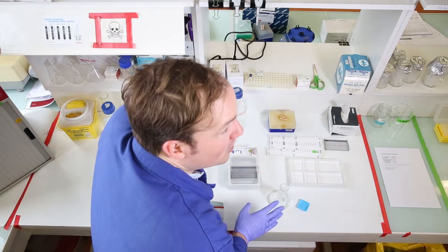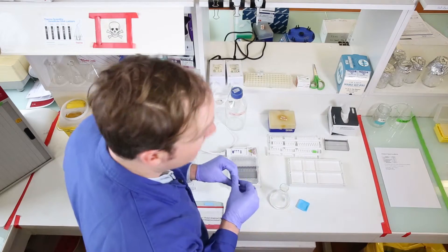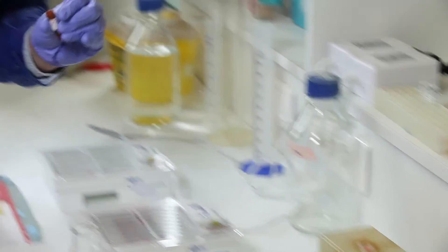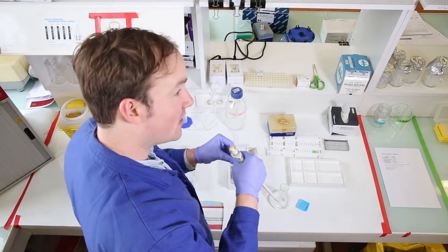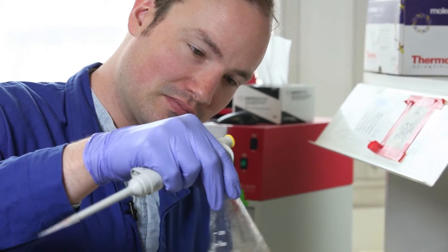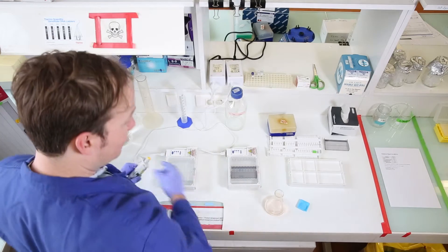Now we'll just leave that on the bench top for a few minutes to cool down until it's cool enough to handle before the next step. We've let our gel cool down a little bit. Next we'll add 5 microliters of DNA stain. This is going to allow us to visualize our DNA bands by making them fluorescent. The gel is prepared.